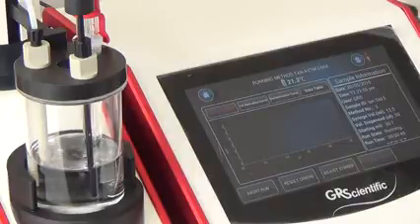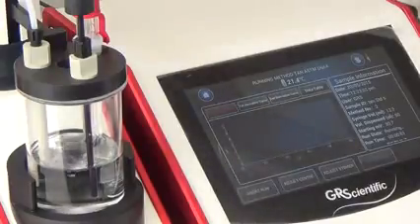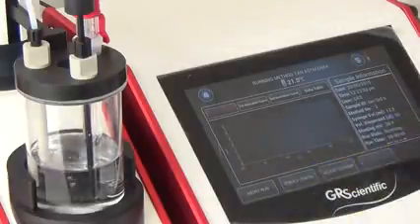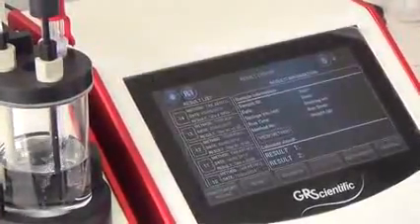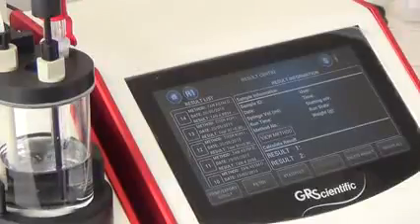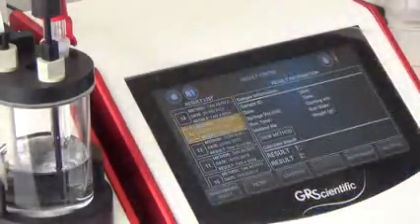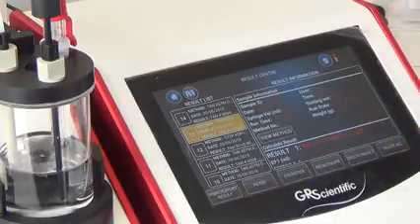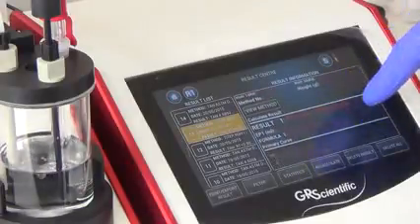Now, I just wanted to show you, previously I ran a standardization of the titrant itself, potassium hydroxide. And I can show you the results of this. Because another feature, if you want to get an average of maybe three standardizations, you'll obviously want to find out the relative standard deviation of them. Here's the standardization I ran earlier. As you can see the result, it's quite an old standard, so I didn't expect it to be near one. But as you can see, I've got a result of 0.9016.